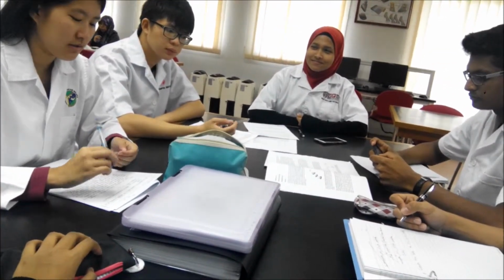We'll start with discussing the experiment we have just conducted. We'll talk about the aim first. For this experiment, the aim is to determine the reaction rate in the presence or absence of an enzyme and to determine the effect of temperature on the activity of an enzymatic reaction.